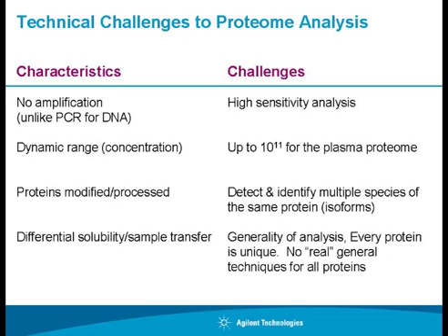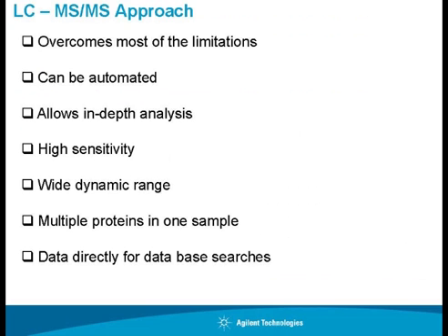And differential solubility. So, generality of analysis: you cannot generalize for this type of tissue samples. This is the method; it may not be true for other types of analysis, okay. So that is how it is complex. To overcome that, we follow the LC-MS approach, which reasonably addresses most of the challenges, okay.